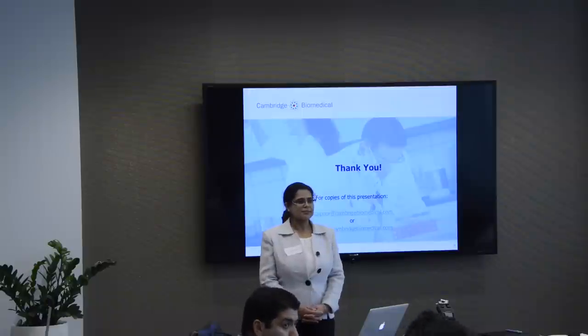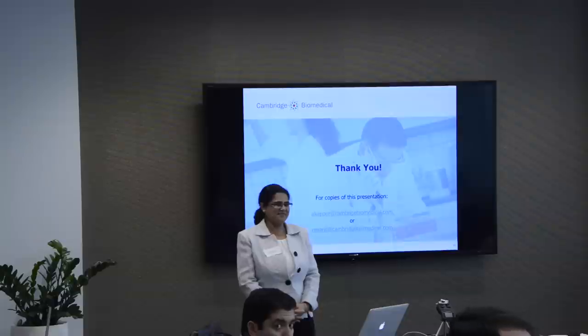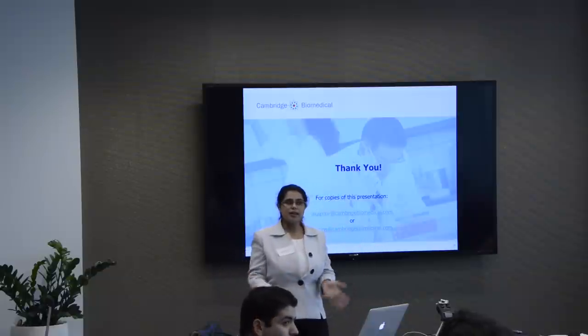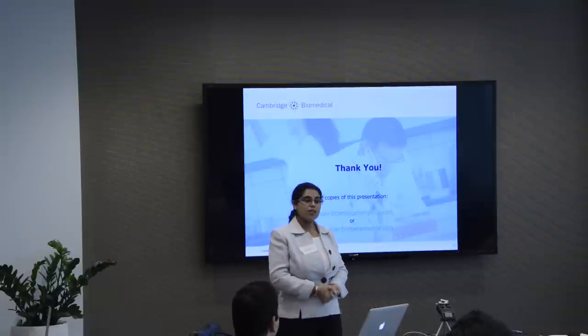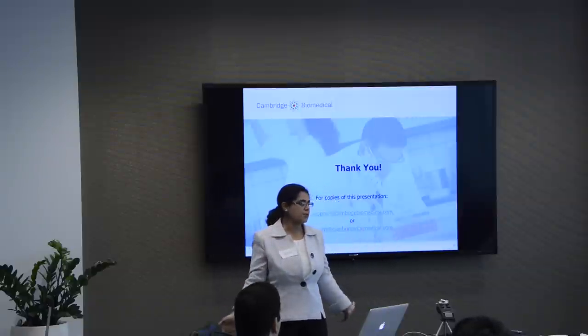So if there was available a magic solution for handling matrix effects, how beneficial would that be, and how much would you be willing to pay for that as an additional cost to your assay? Remember, if you know what that magic solution is... I'm going to say that we might have one. I don't know whether it's the same magic solution or not, but you can remove the globulins and you can strip the plasma sample.